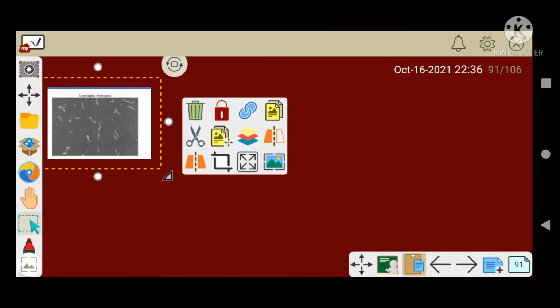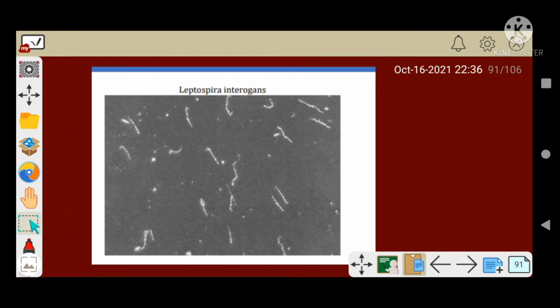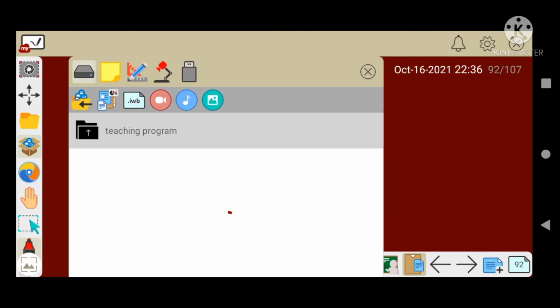Okay, so this is your Leptospira case we have discussed in our previous session. So this is your dark field microscope. Dark field microscope, because it is a slender organism, we need a dark field microscope. We discussed that in our previous session. And it looks something like this. It is spiral shaped. Rodents are the organism source. Very good.